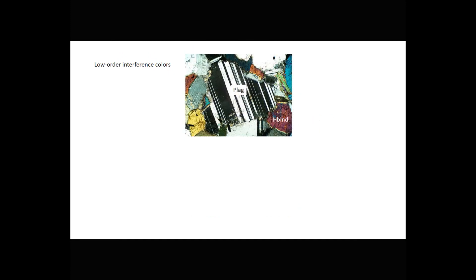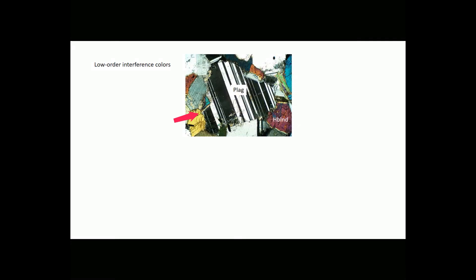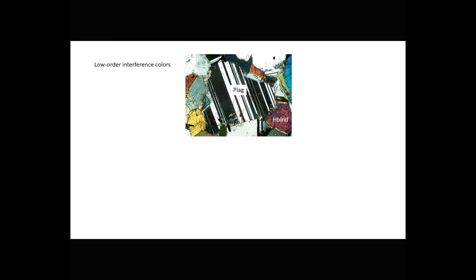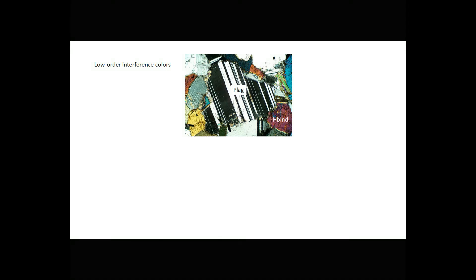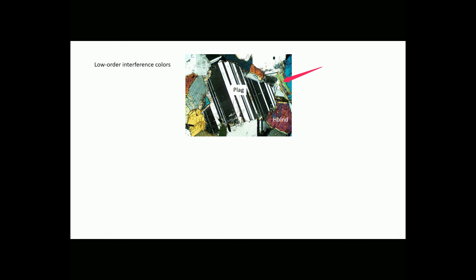Here is another example of interference colors in feldspars. This is plagioclase, showing typical zebra-stripe twinning. The interference colors vary from black to white to gray as you rotate the stage. The thin section also contains hornblende, which shows higher-order, second- or maybe third-order interference colors. And there is one flake of mica which also shows higher-order interference colors.